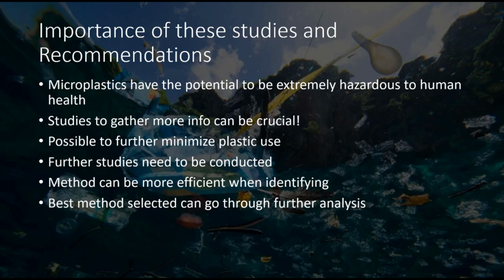Methods other than observing through microscopes, where more advanced technologies can be used to identify plastics filtered. The best method selected can go through further analysis to standardize and identify microplastics using oysters as an indicator species along the way. I thank you for listening to my presentation.